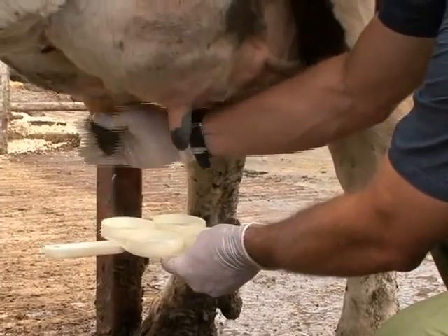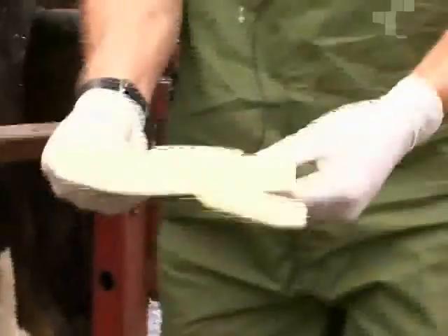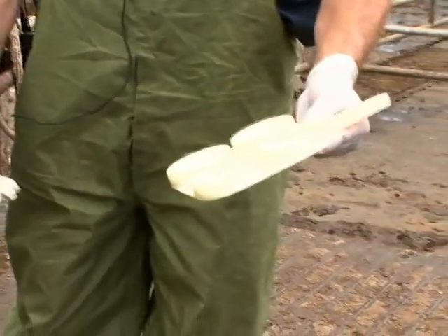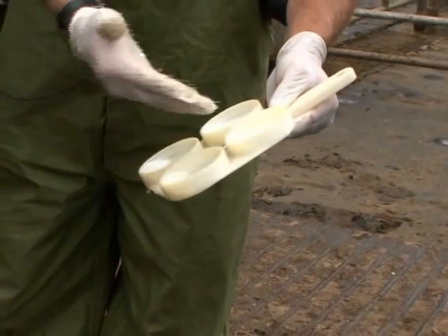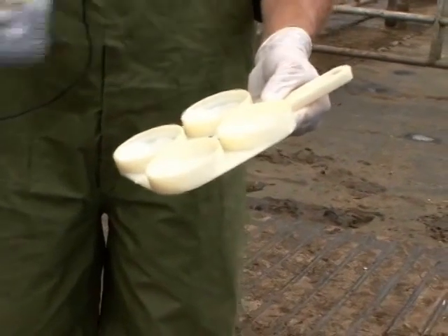Once we're finished adding enough milk to the receptacles, what we will do is we will tilt this device over to the side. This paddle would be tilted to make sure we have an equal amount of milk into each well, and it looks like we have an equal amount of milk in each well.